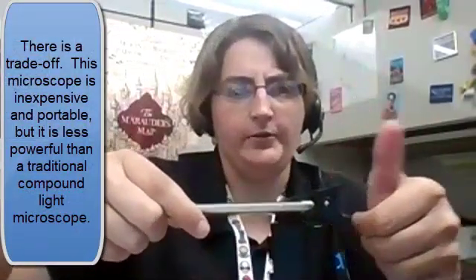So it just fits right onto your phone, and then you can record or take pictures of whatever you're doing through the camera app on your phone.